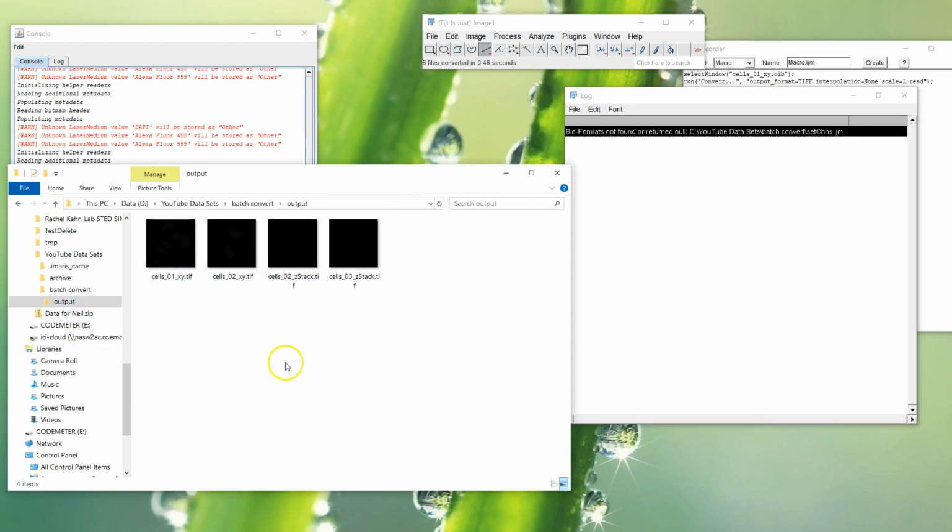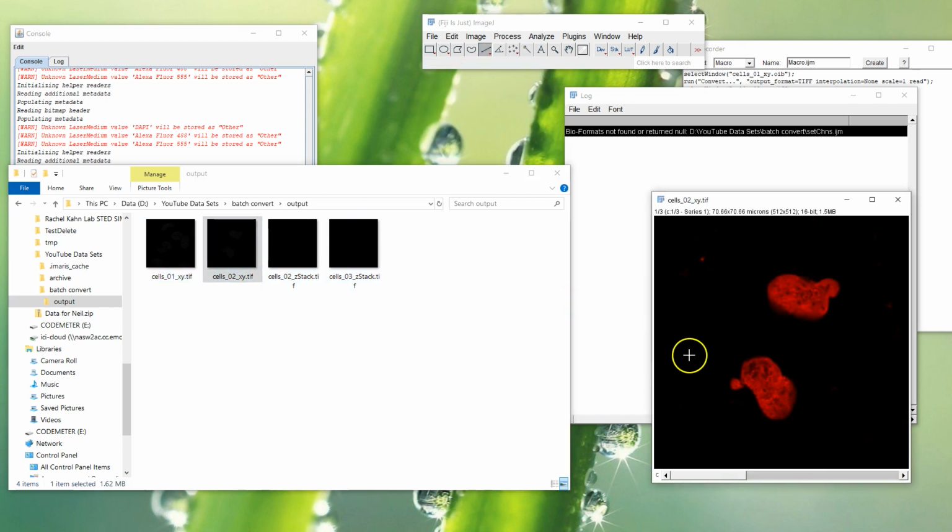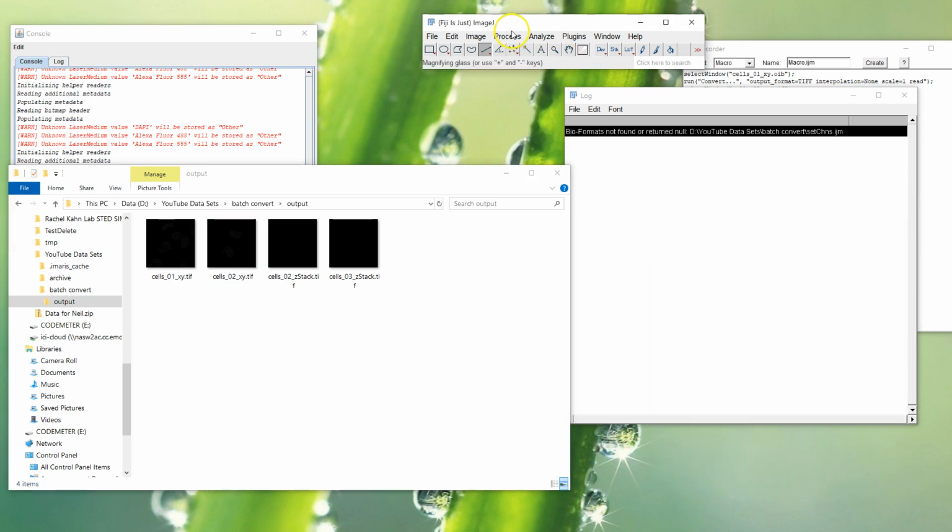So we'll go to the output folder, and we see that we have these black thumbnails, which is Windows trying to read a thumbnail from a data format which is not what it's expecting. The data itself is in there. It's a 16-bit data file. It looks nearly identical to the raw file with less metadata really. So that's the short story of the convert option.